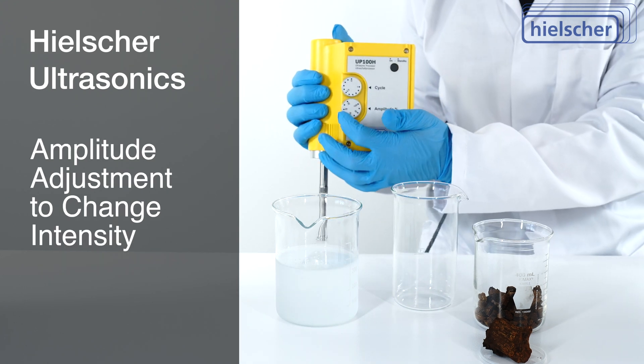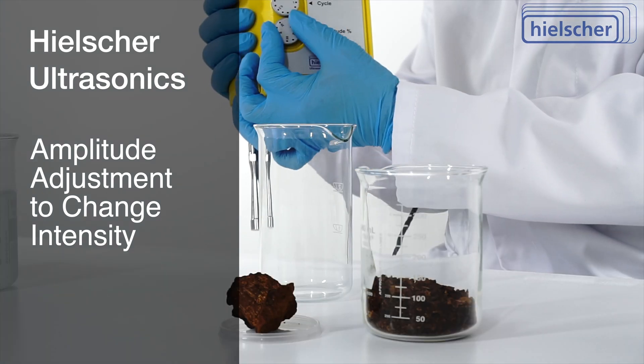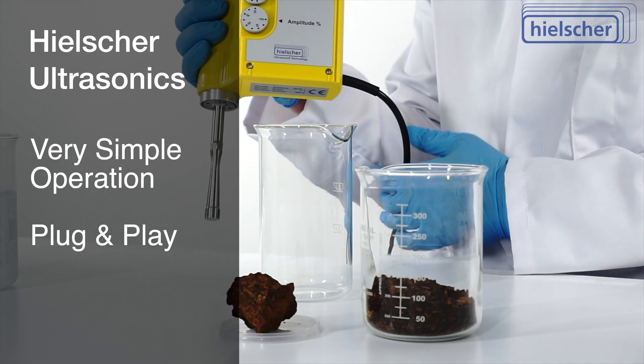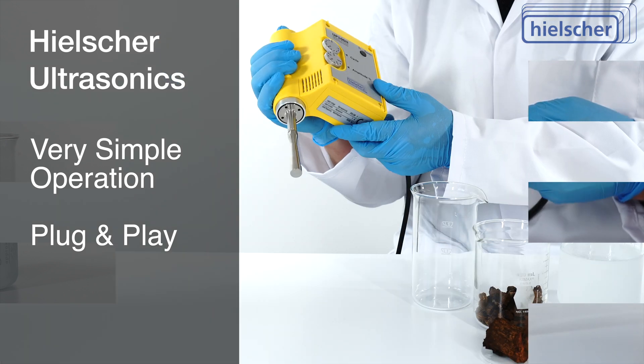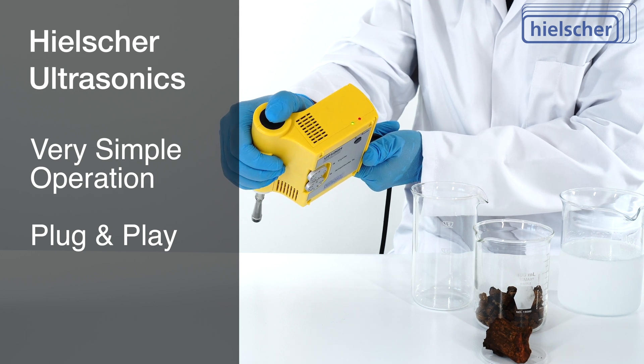You can adjust the intensity using the amplitude dial. We will use 100% intensity for this extraction demonstration. The power cord plugs into any standard wall outlet. All you need to do is push the top black button to start the sonication.